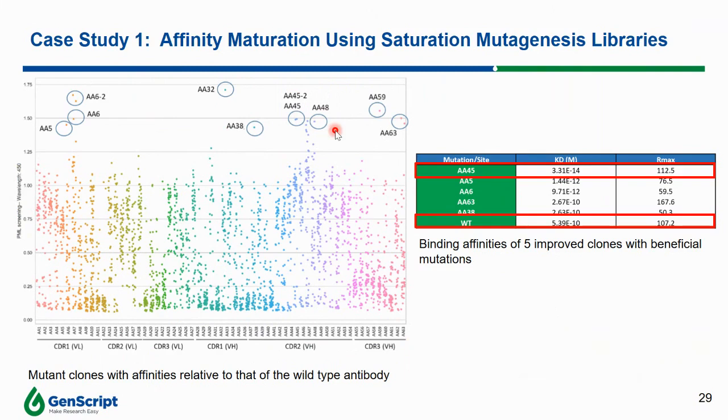The SPR assay results revealed 5 mutants with affinities higher than the wild type. One of these mutants displays an affinity even in the femtomolar range, as shown in the red boxes, highlighting the capability of our PML to generate such high-affinity mutant sequences.